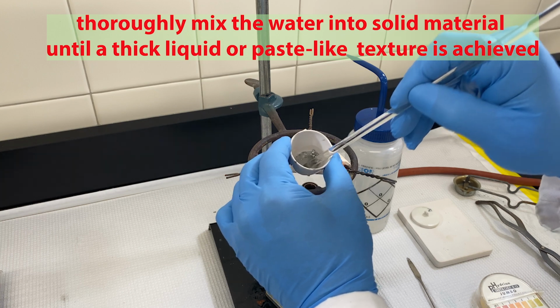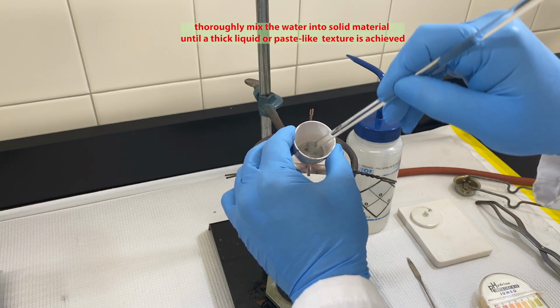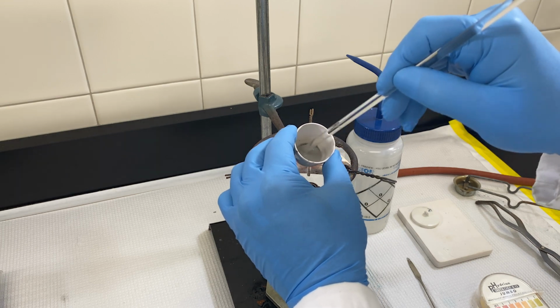To the cooled material, we'll add some water, mix it up really well to make a slurry, and then run the reaction a second time. The reason for running the reaction in the presence of water is provided in the lab manual text.